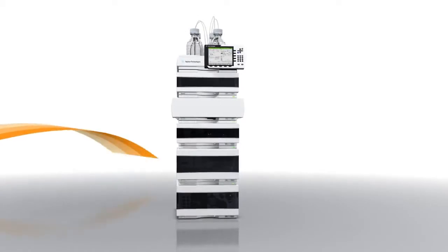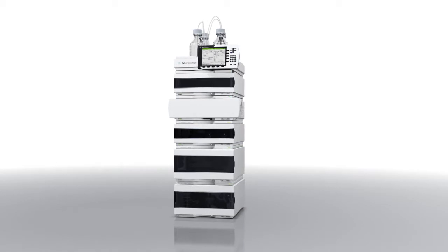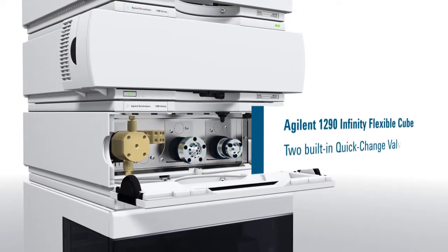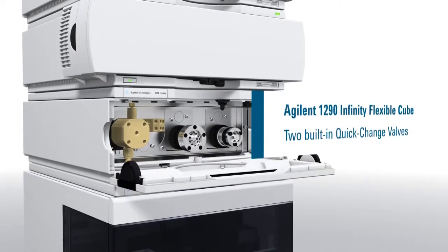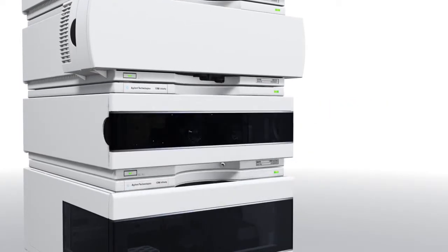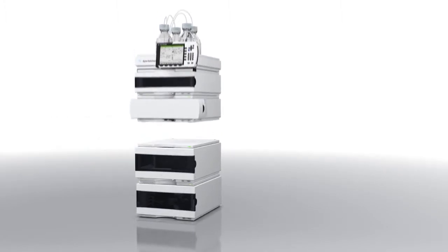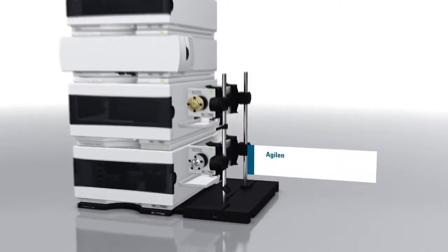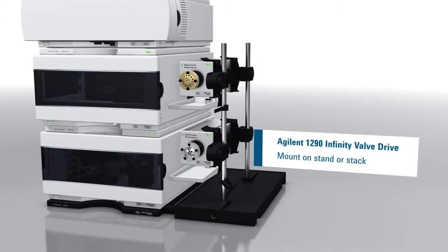Choose between externally mounted valves or valve-containing modules in your 1200 Infinity Series LC. Up to 2 quick change valves can be fitted in the 1290 Infinity Flexible Cube that also contains a pump and an additional 3-channel solvent selection valve for advanced applications. Alternatively, an external valve drive unit can be mounted directly on either side of your 1200 Infinity Series LC or on a freestanding multi-purpose column and valve holder.